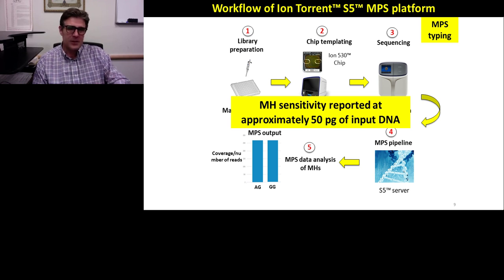Oh, the first is the sensitivity. So the sensitivity that we were able to obtain, we obtained full profiles down to 50 picograms of input DNA, which is very similar, if not better than most of the conventional STR kits that are commercially used by prime labs right now.